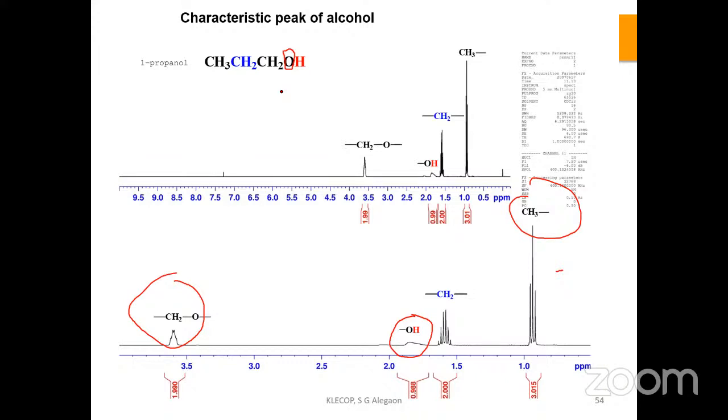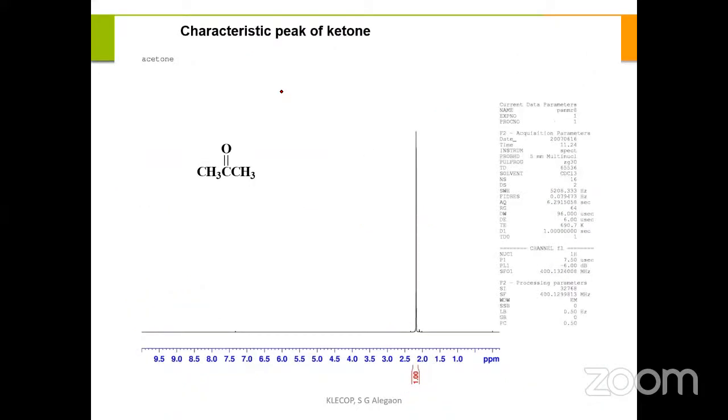Any proton attached to carbon, attached to oxygen, attached to nitrogen, or attached to sulfur, how are they going to act? It is on the basis of the electron cloud or electron deficiency. If more electron deficient, these protons will resonate downfield rather than upfield. Look at this.